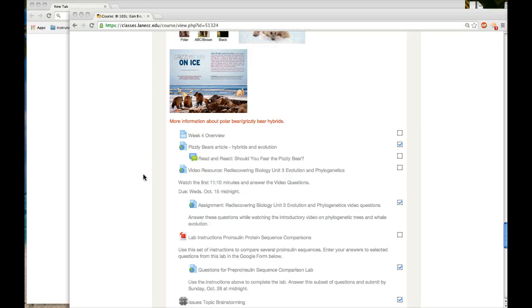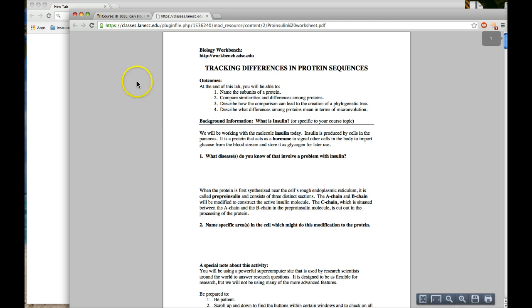Hi, this is the video to go along with your lab instructions for the proinsulin protein sequence comparison. This is going to take a little bit of patience and a little bit of working through some things to understand what you're seeing, but I'm going to walk you through all these things. You should have these instructions open next to you, so if you have that PDF up, that's a good thing.